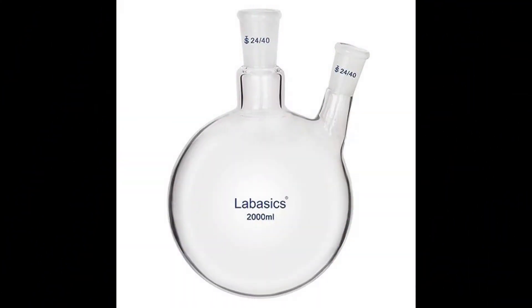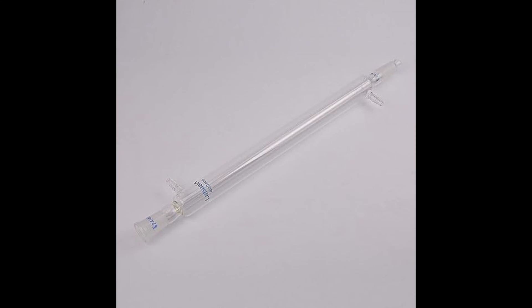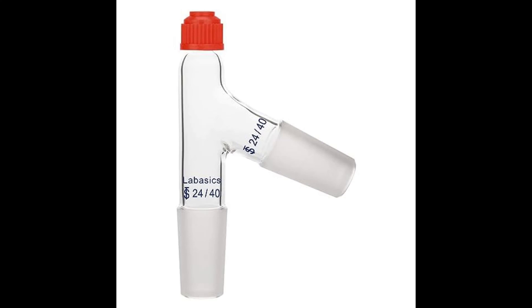You'll want a two-liter double neck flask for sure — that's big enough that you won't have boil overs. You'll need a vacuum adapter and a condensing tube; I suggest you get the 400 millimeter, that's big enough.